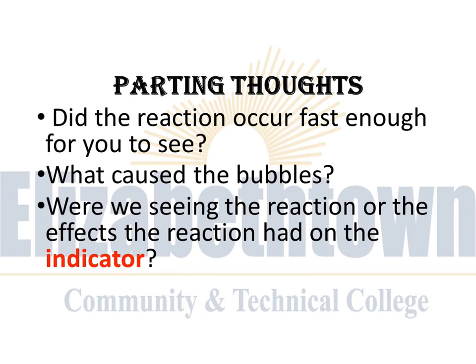Here are 3 questions to think about while you perform the experiment. Did the reaction occur fast enough for you to see? What caused the bubbles you're about to observe? And were we seeing the effects of the reaction or the effects the reaction had on the indicator?